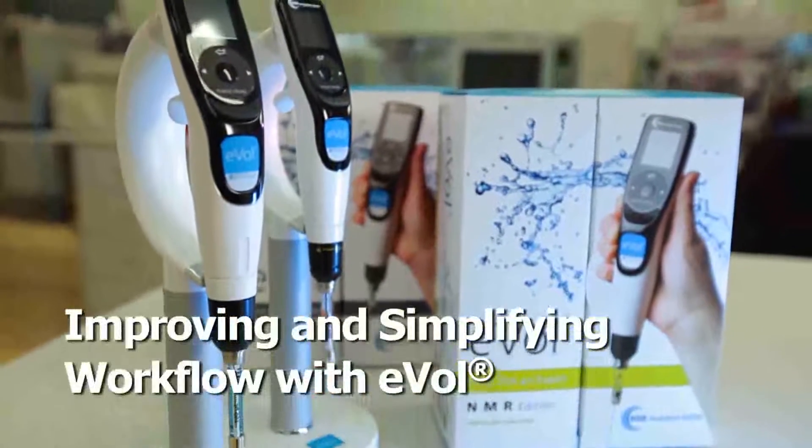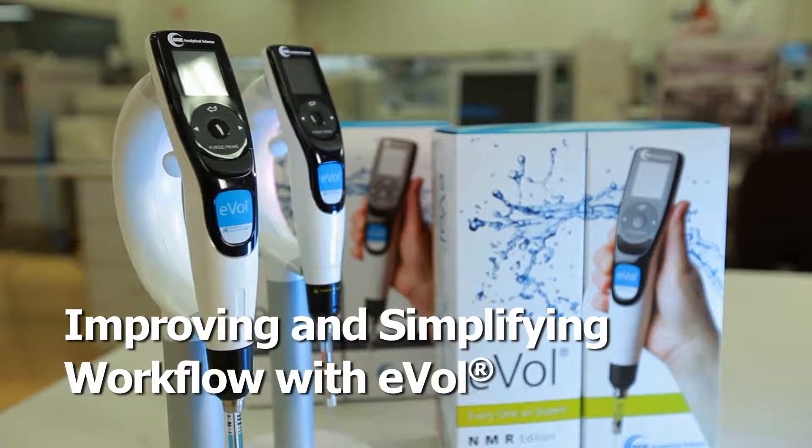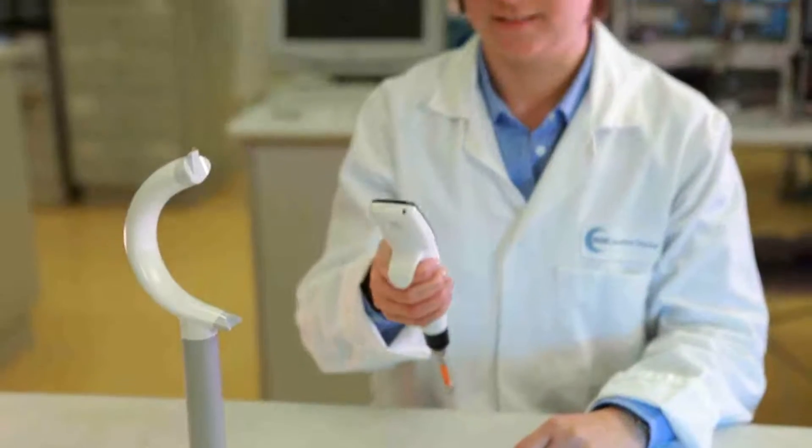EVOL gives consistent results independent of the operator and improves accuracy and reproducibility. The custom step-based programming mode allows for the creation and storage of multi-stepped dispensing protocols.